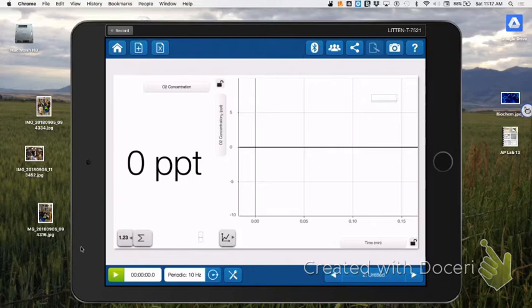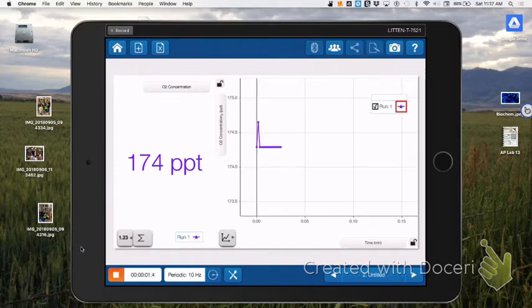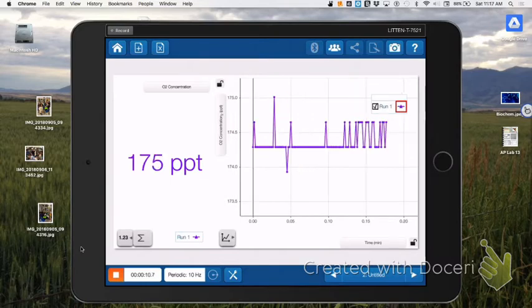Okay, in my vial, just for starters, I am going to make a 1.5% solution of hydrogen peroxide with 0.5 ml of catalase. I have added the catalase. I'm gently putting the sensor on top so gas can escape, and I'm pushing play. It's now going to take the readings for me, and I can have this run for a minute, which I'm going to do, but I'm going to pause the recording and then I'll pick it up here at a minute.